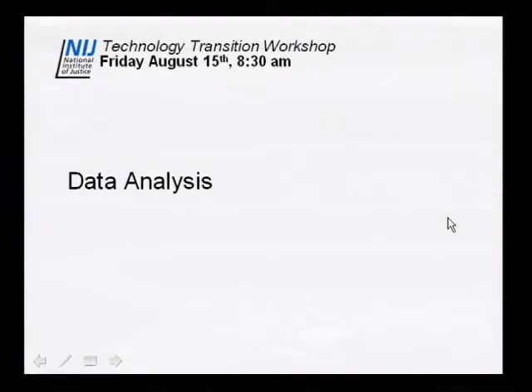Good morning. Welcome to the second day of this presentation of the workshop. And today we're going to be talking about data analysis. So the first part of this presentation, I'll just go over generally what we do for data analysis, how we take raw data that comes out of the system, process it such that Allele Calling software can read it in and assign the proper alleles to each of the locus.